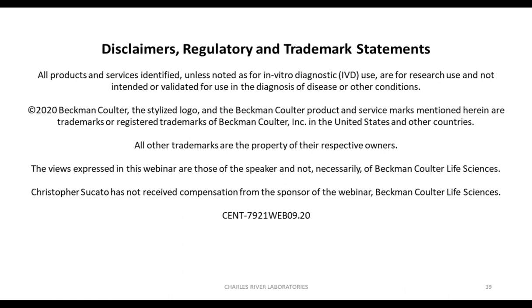Yeah, that's great. And clearly, any kind of software offering in that regard, it should model what's present in chromatography, for example, having password-based restrictions to entering into the software, having audit trails for any changes that might be made to a method or fitting parameters, etc. Having that auditable where the user is required to acknowledge any changes, and that's tracked.